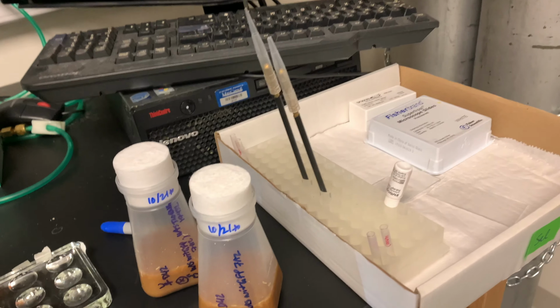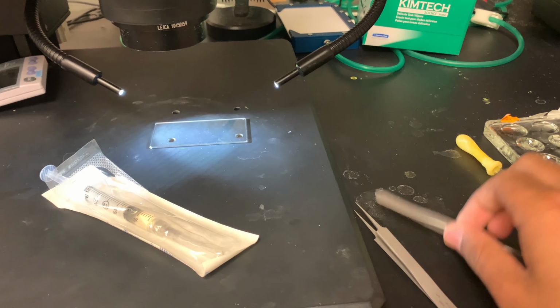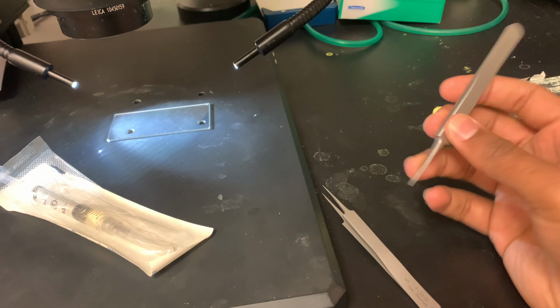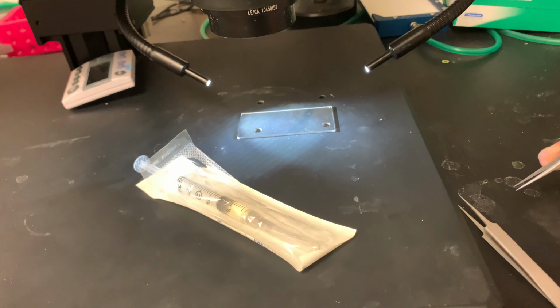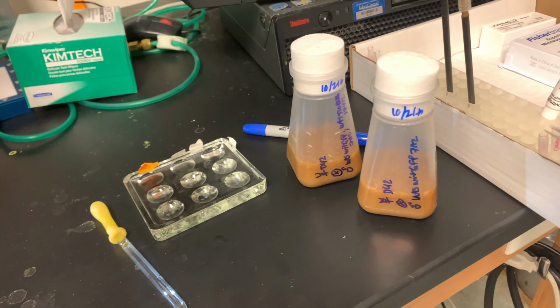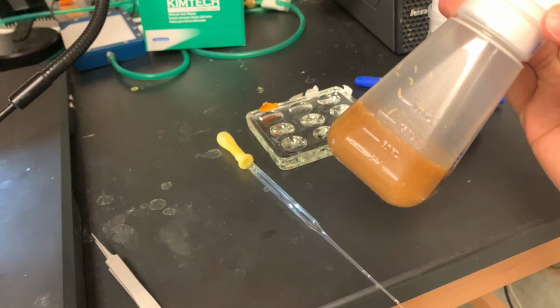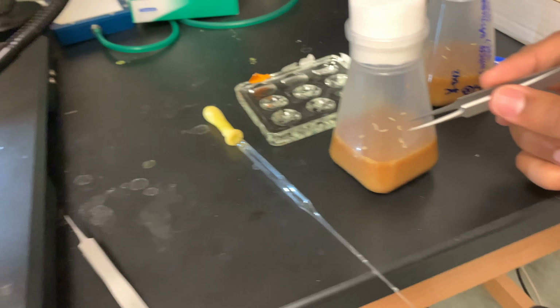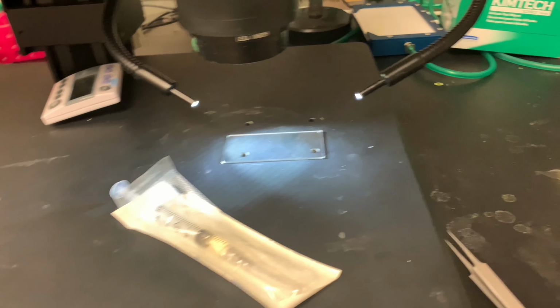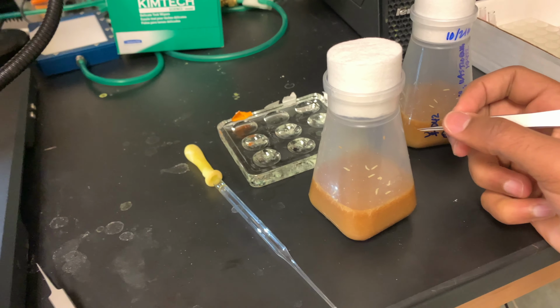Alright guys, so we have everything ready and set up to dissect, and we have our two pliers to actually do the dissection. I hold one in each hand, and we usually get started with the control group, which would be this set of flies, and then we pull out the larvae. Usually I put out 6 of them on that glass plate over there, and we start our dissection. It usually takes about 20 minutes to do both. So I'm going to go ahead and get started, and I'll see you guys in a bit.